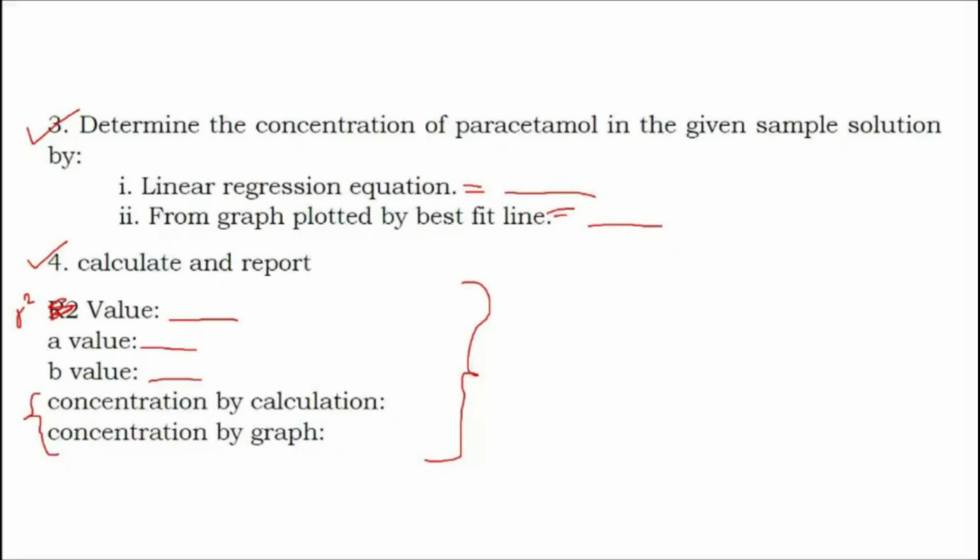Okay, so those who have completed writing everything will not disconnect the meeting. They will write down till the results and let me know in the comment box that you are done till results. You will write down done till results. When you write done till results, I assume that your graph, interpolation and dilution factor calculation, everything is done.